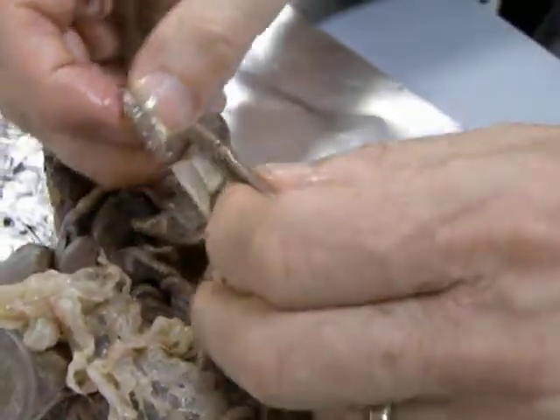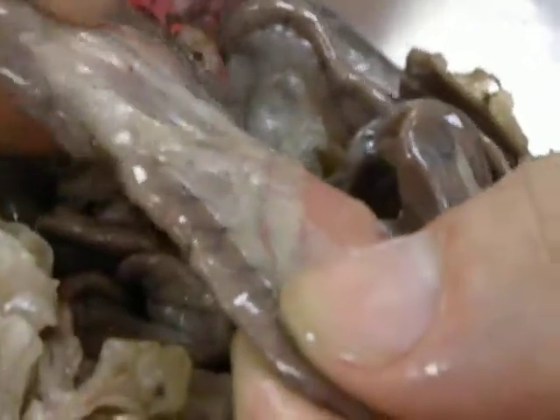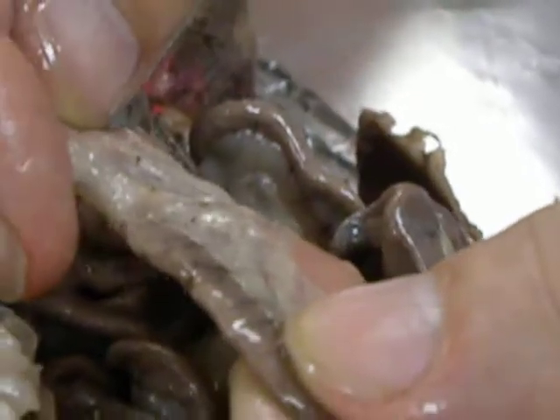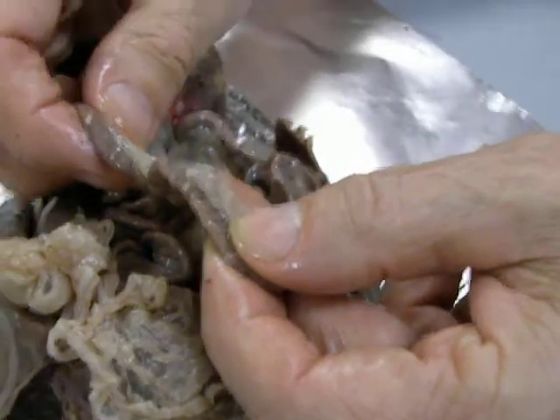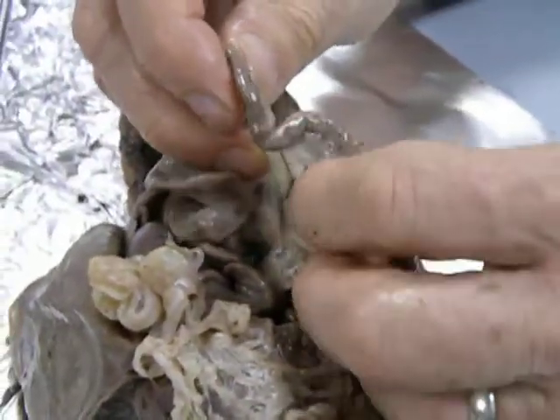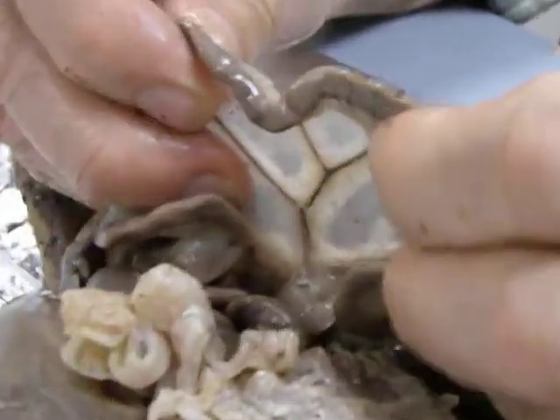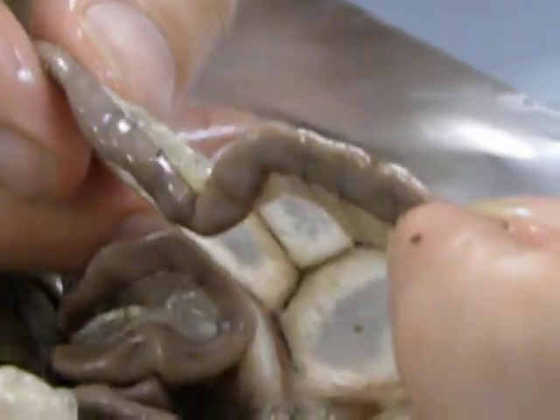Again, if you're in the right light and got the right visual angle, you can see blood vessels in there. And so the second function would be to prevent the tangling of the blood vessels, or vascular system. What you can't see but is there are nerves, so it prevents the tangling of the nerves. Also, what you can't see, because it's not injected properly, is the lymph system, which also is protected from tangling. There's a lot of squirming goes on.